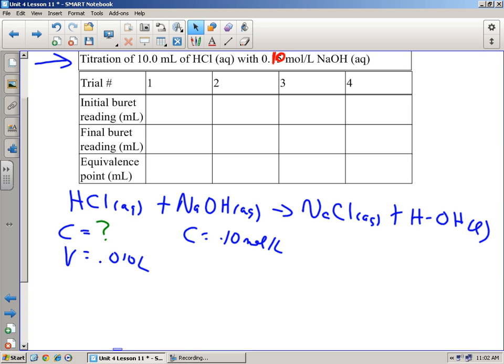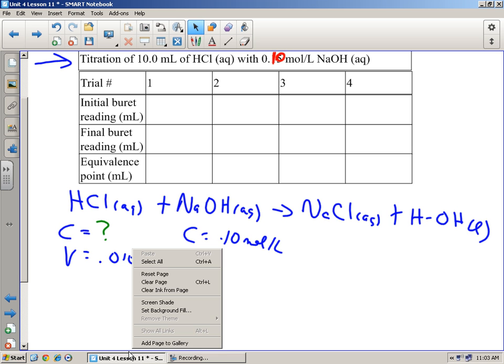So, there's my first experiment. It's done. Okay, this, so you guys can see, is probably a little too dark. Okay, that kind of looks like, well, just basically a base. All right, so what's actually happened here, I've added too much base into here. I've neutralized all the acid, and I got a little bit of extra base left over, right? Because it's too pink. So we want a nice light pink.